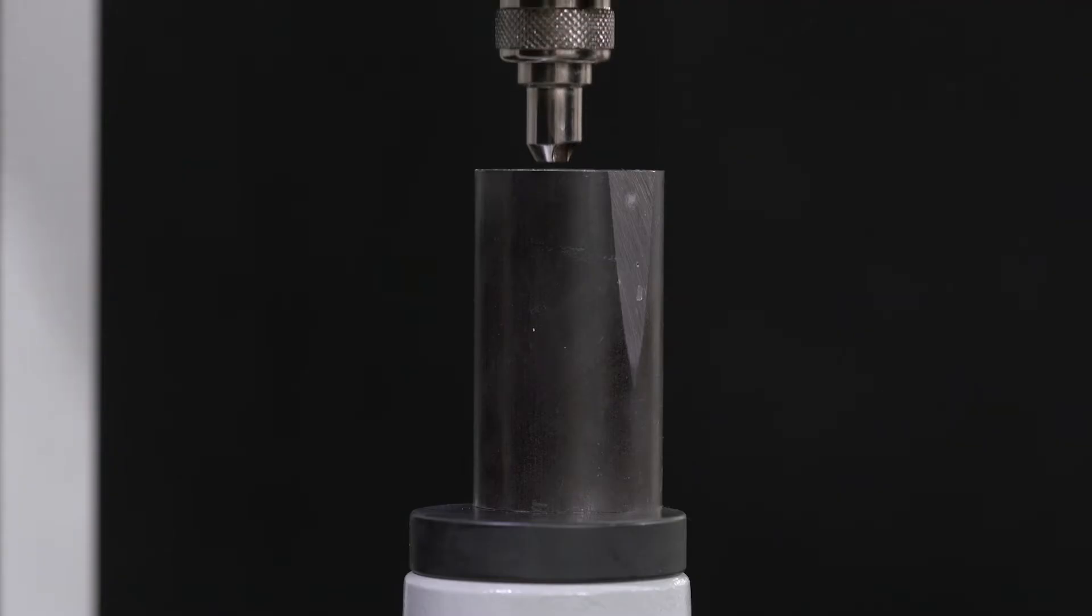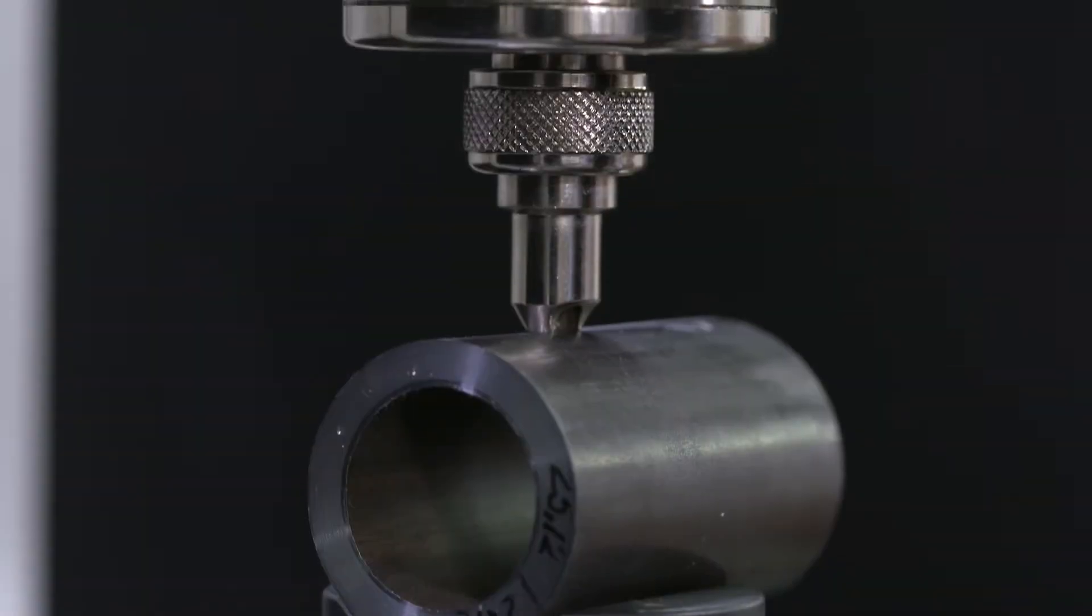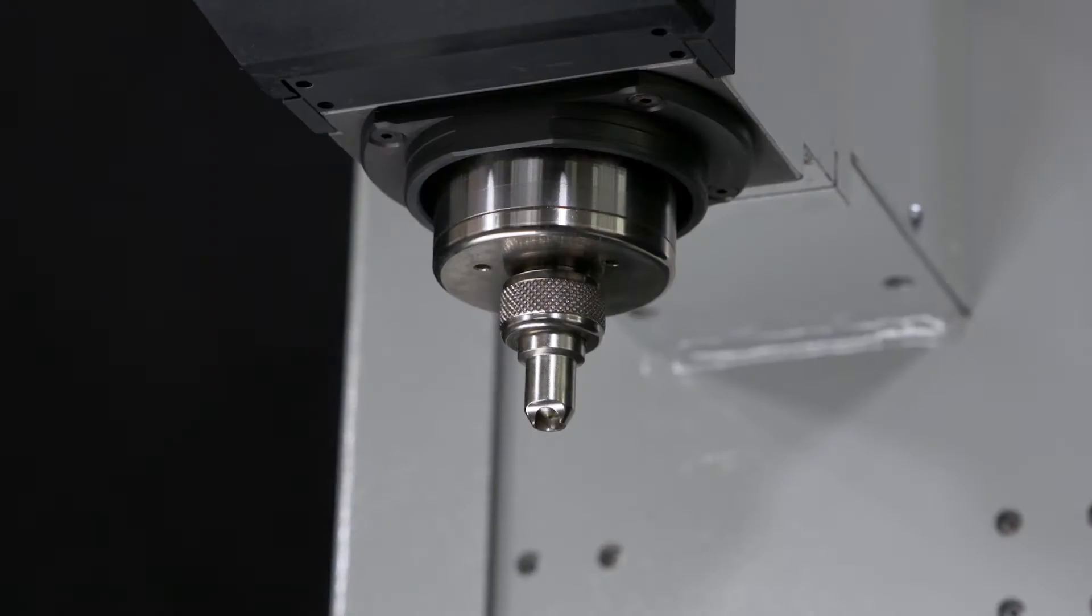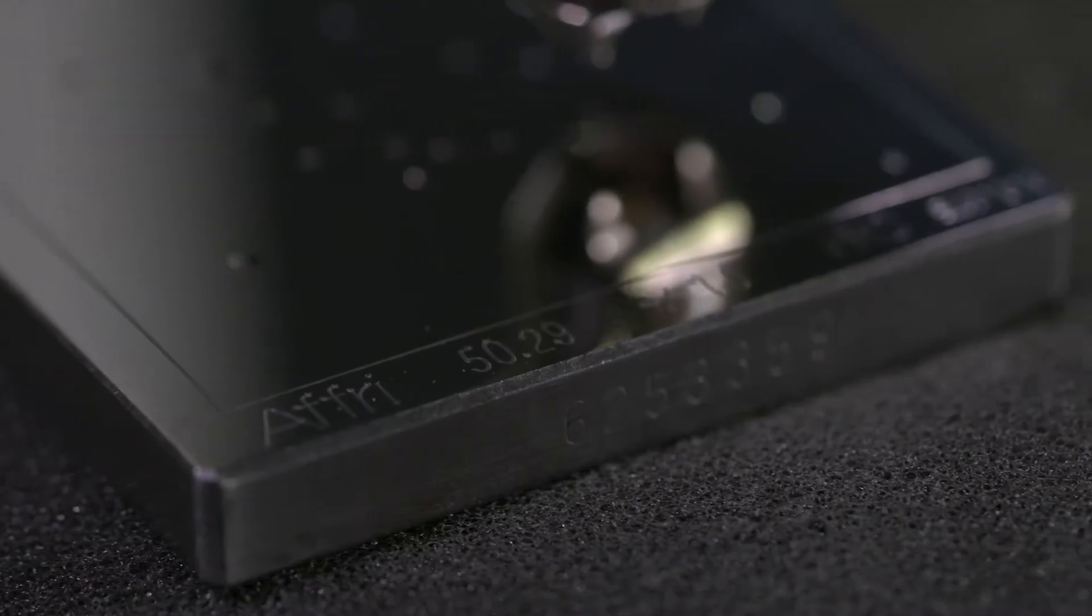The clamping system holds the sample in place prior to testing, ensuring perpendicularity and stability during testing.